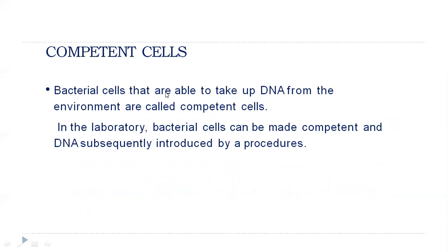Now, what are actually competent cells? Bacterial cells that are able to take up DNA from the environment are called competent cells. Suppose you are competent to take foreign material in your body; likewise, the bacteria are also competent only when you are able to insert the foreign DNA material inside the cell.